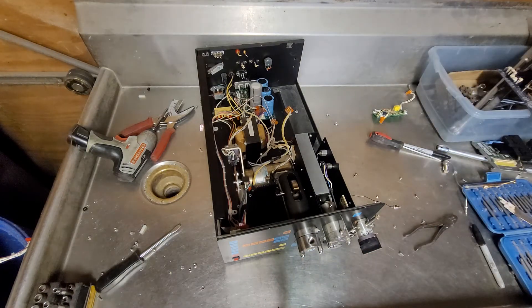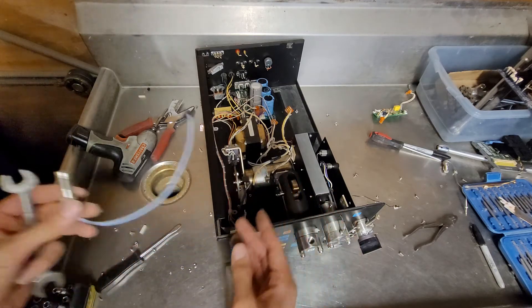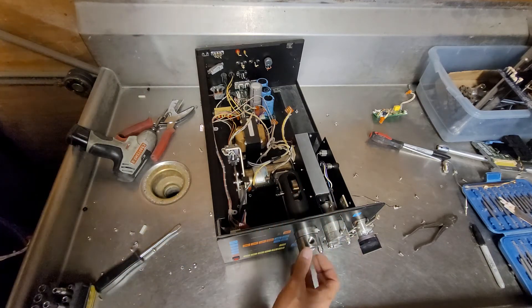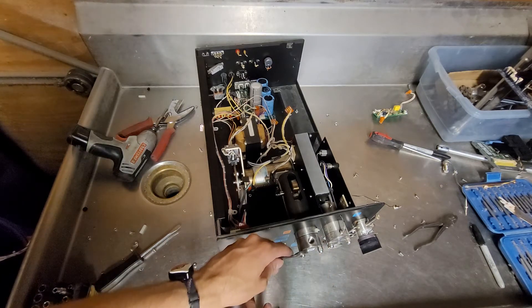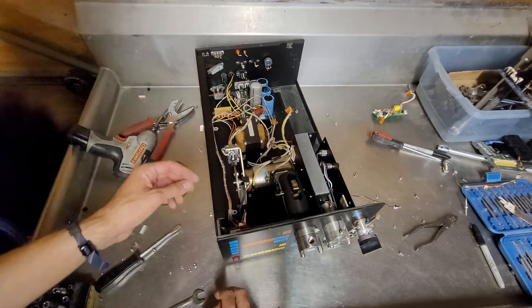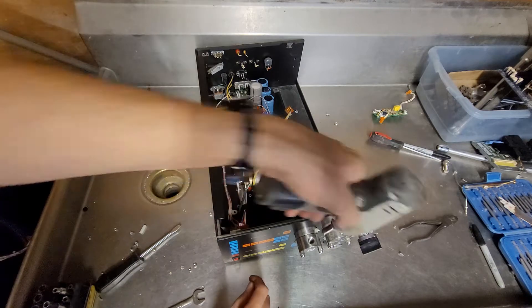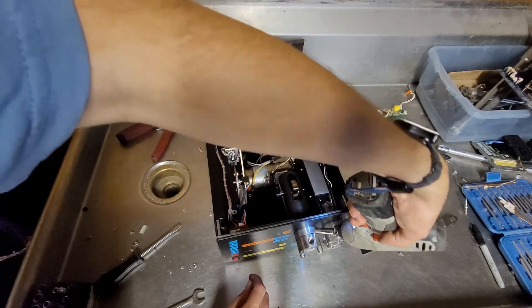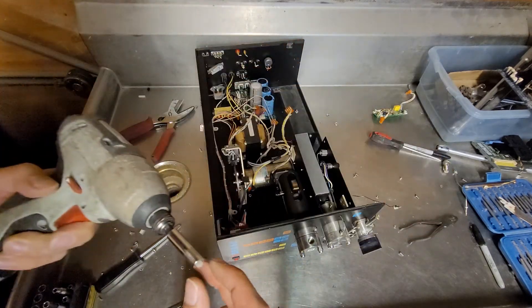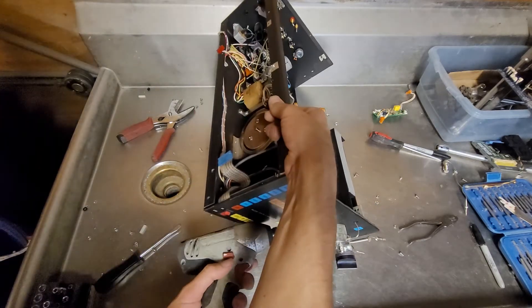It's the same style of tubing that the other stuff used, so I'll save that. This other piece isn't getting saved though. That's not going to go through without me removing those. A quarter inch plastic tie-downs.